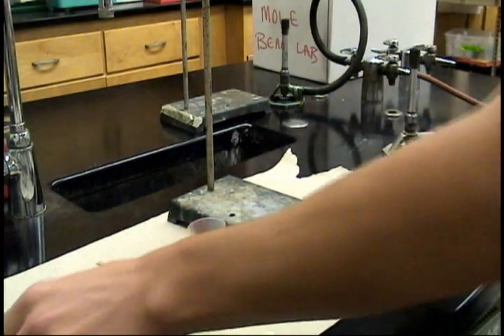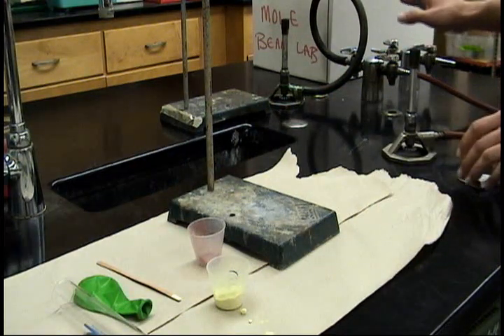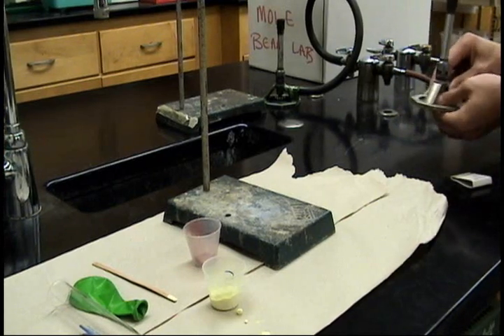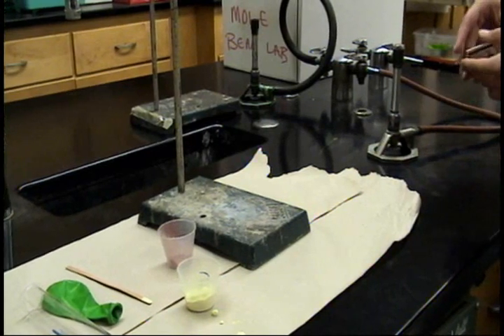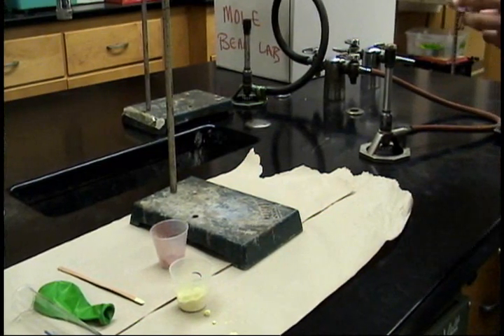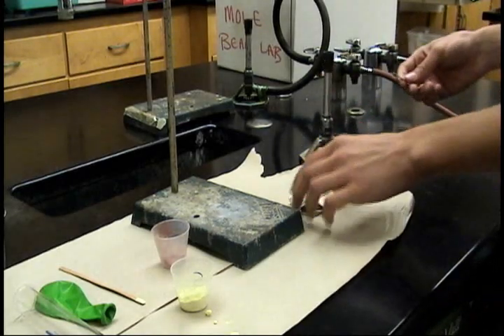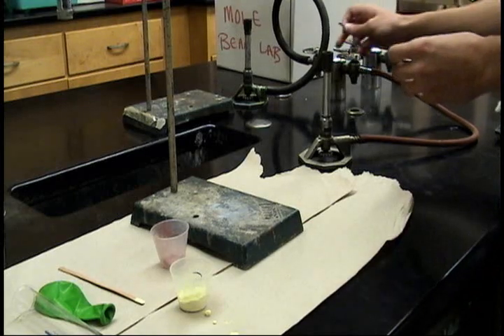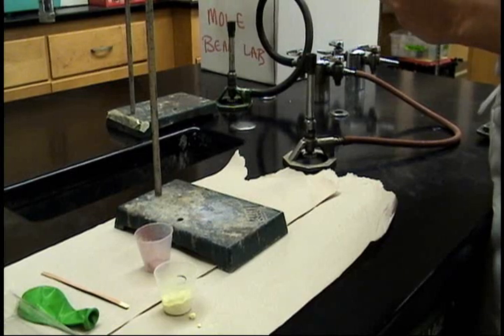And now to light the Bunsen burner using the matches. The Bunsen burner is lit — it turns straight, and I'm going to make sure it's set up. Light the match first, then the Bunsen burner. You don't want gas everywhere.